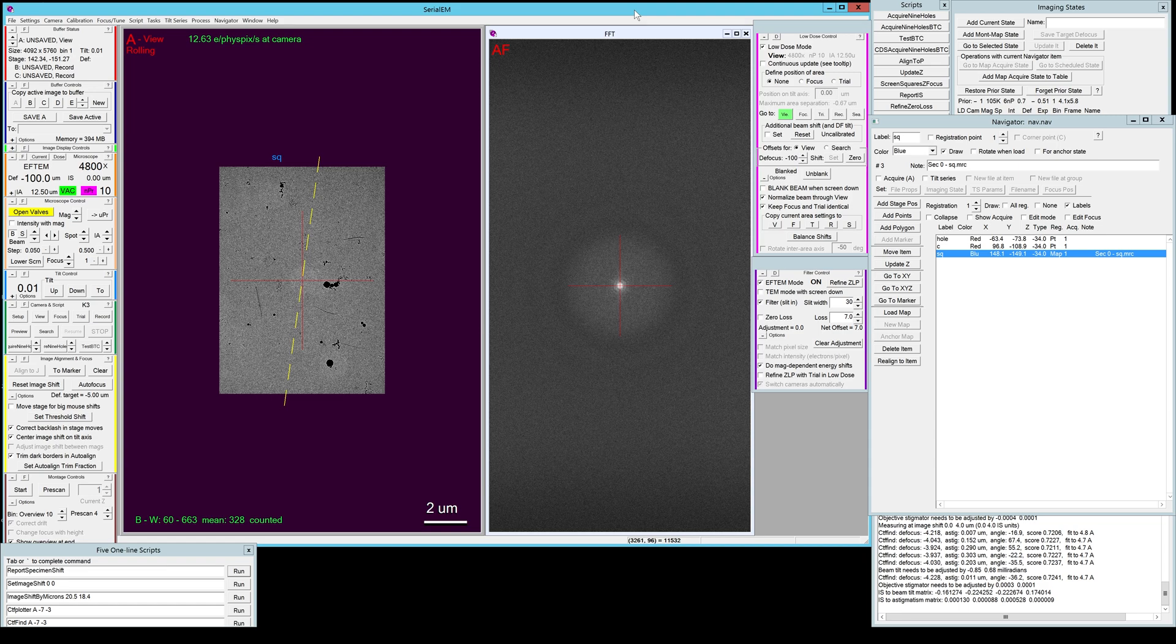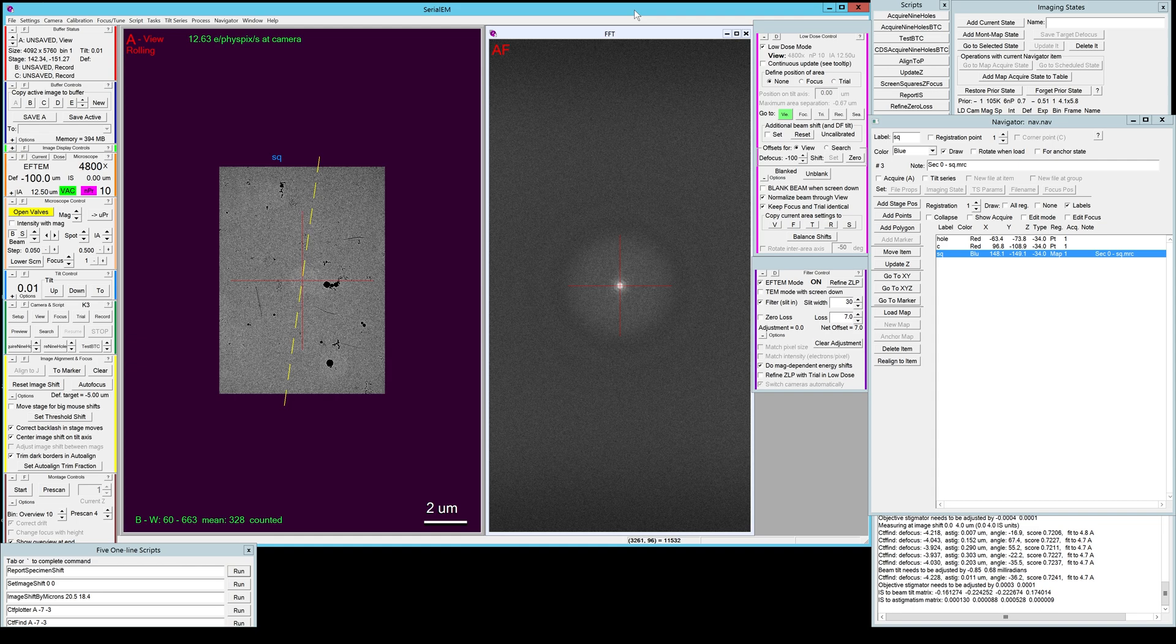Hey everyone, this is a video tutorial for my parallel cryo-electron tomography scripts, in short PACE TOMO. I decided to split this tutorial up into several videos where I illustrate the different workflows, so please find the other videos in the descriptions.